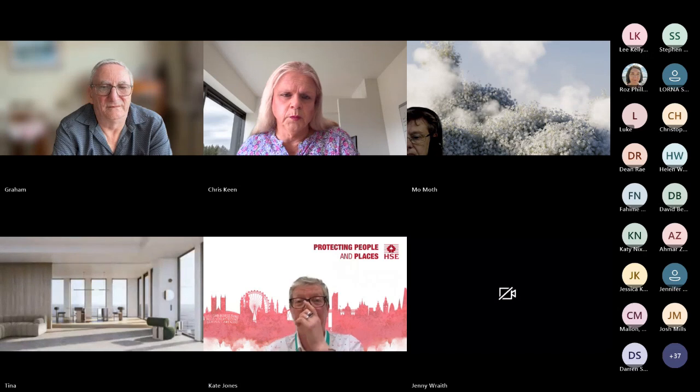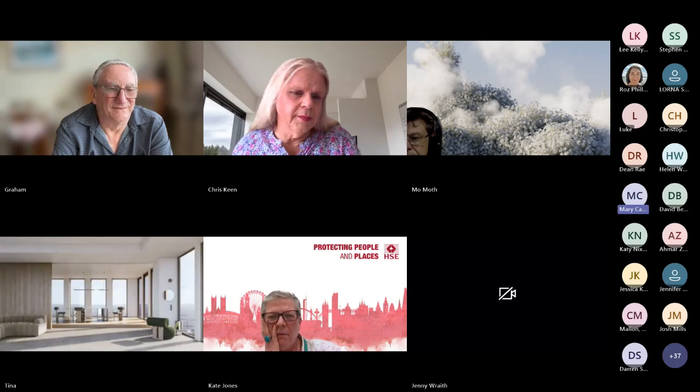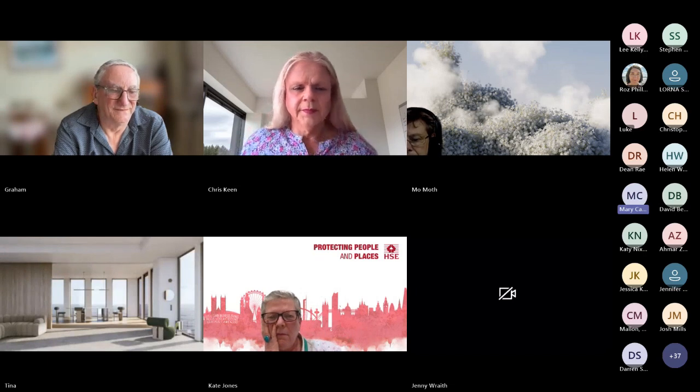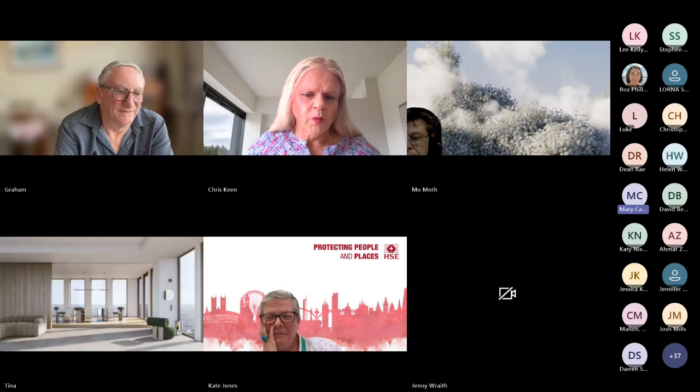Mary. Hello. So, curious question. Let's say I'm doing MDHS 25 to the T, but I'm requesting the filter size as the 13 mil instead of the 25 mil, because then I could put it in a Swinnex under the air-fed BA. What sort of issues would that cause? Is that allowed? I've never attempted it before myself, but I've always been kind of curious if I could go that route.